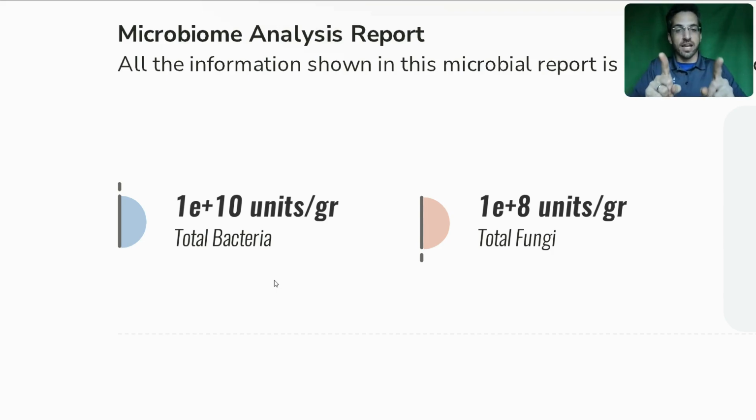It's very wise to have 2 samples to compare between each other, because if you've got the 1 sample, great, you've got it benchmarked against our global soils database. But it's even better if you've got 2 samples, one that has the problem you're trying to deal with, and the other one that doesn't have that problem, but is otherwise on your operation, similar climate, say it's a similar soil, make it as similar as can be without the issue you're trying to solve. That'll really help you narrow down specifically what are the biological factors that could potentially be driving this problem I'm observing.